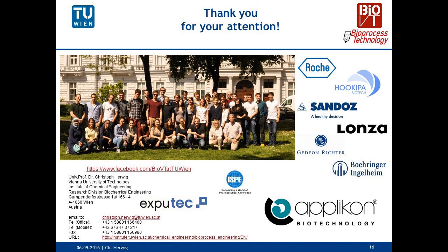However, the real acceleration which we would like to show here is of course only done in real time. So we emphasize real-time implementation and execution of that. And this is possible in Lucullus, both the historical way and the real-time approach.